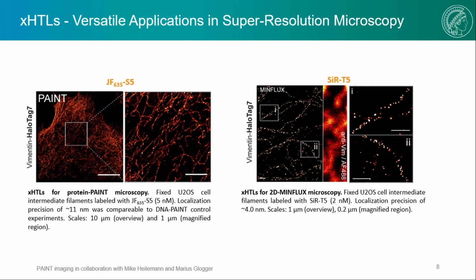We did the same experiment basically by using MINFLUX, and here we achieved 4 nanometer localization precision, really resolving single vimentin molecules.